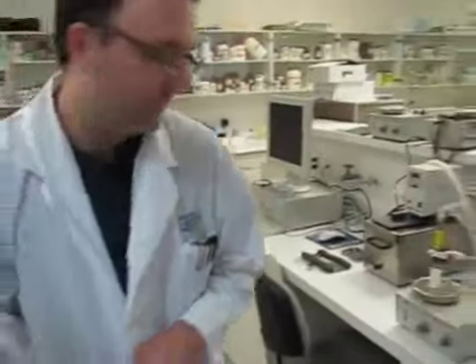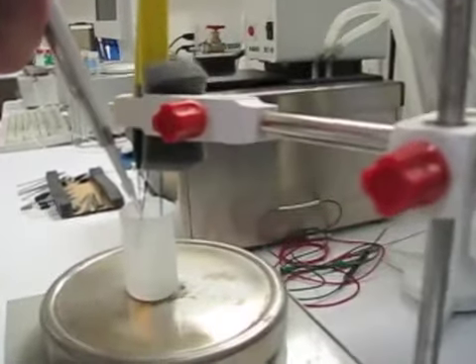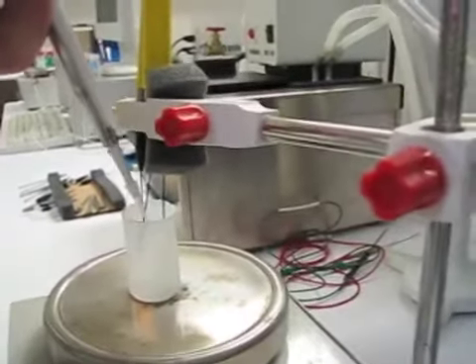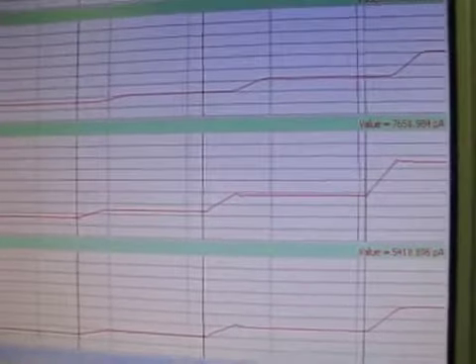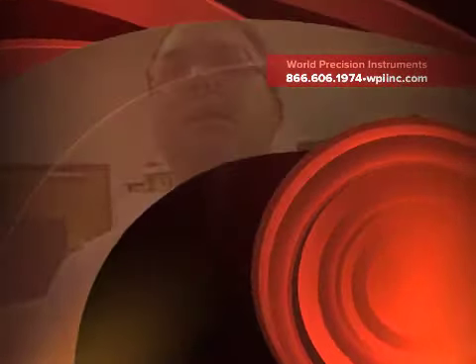I'd like to note I'm making this the last concentration because with the sensitivity of the sensors, if I double after this point, you will not be able to see the true response because it will peak out of the range. I'd just like to make a note that you're welcome to go at higher concentrations. You just need to adjust the units and the display and range accordingly to see the true response. So until next time for the next calibration, signing off.